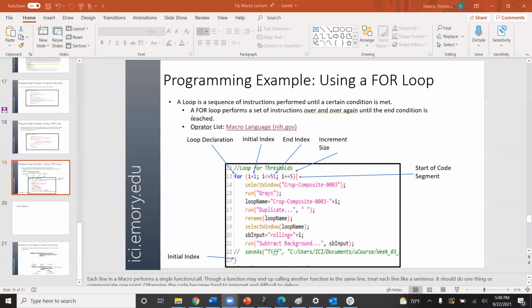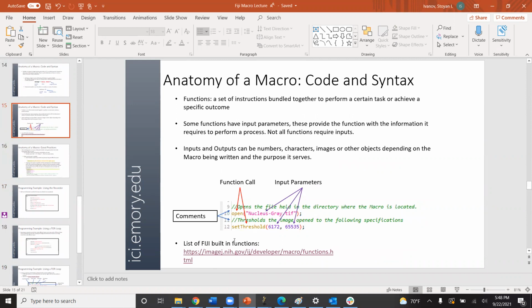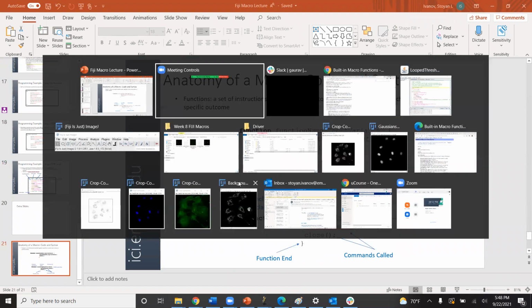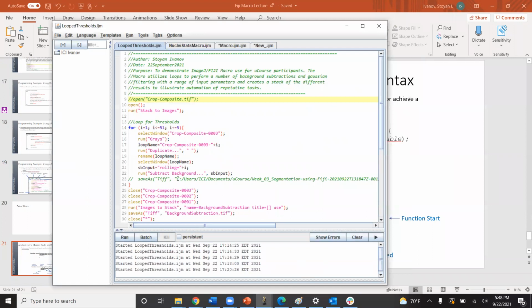All right, so if anyone still has questions, feel free to ask. But before we conclude for today, I wanted to go over one last part. You might have noticed how some of the components here are compared.